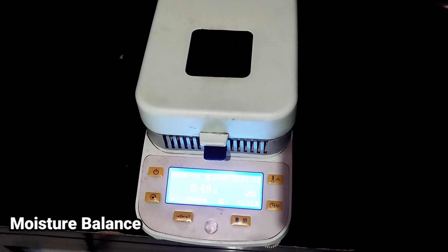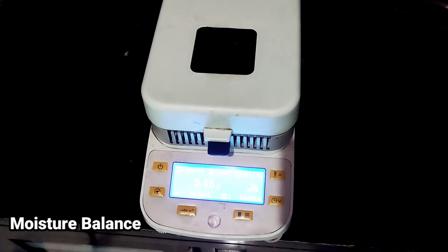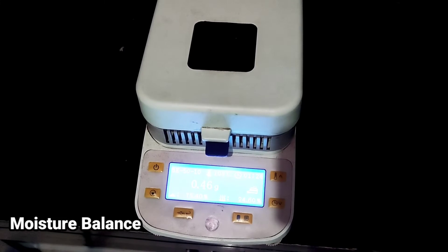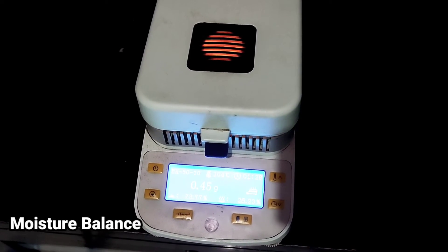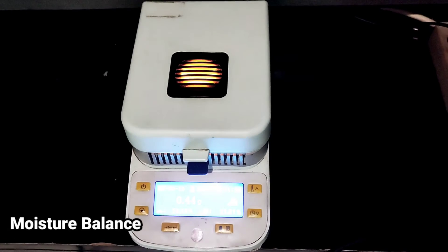We can see that the time is 1 minute left. One minute later, the alarm will sound. Thank you.